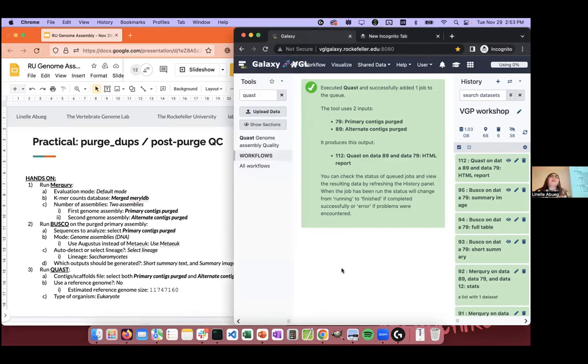I think I'm going to start looking at some of the QC now. Good with this? Okay. Keep this in.